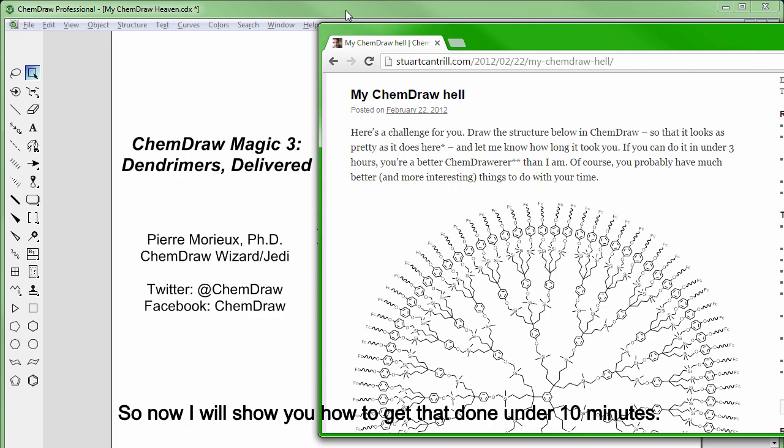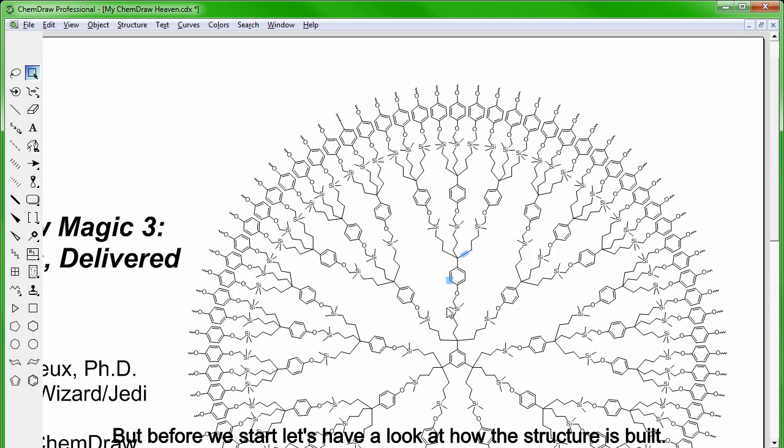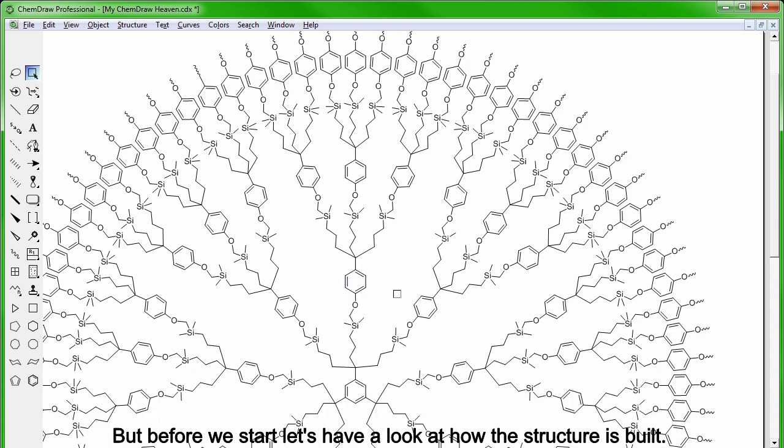So now, I will show you how to get that done under 10 minutes. But before we start, let's have a look at how the structure is built.